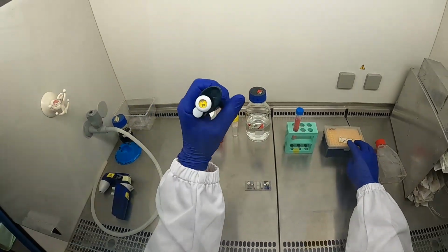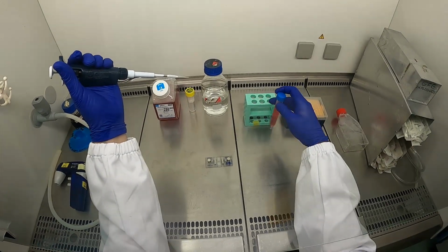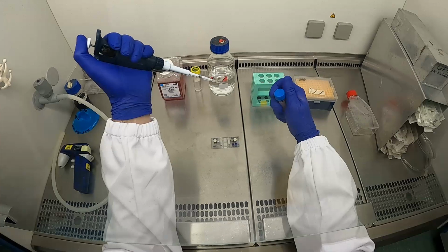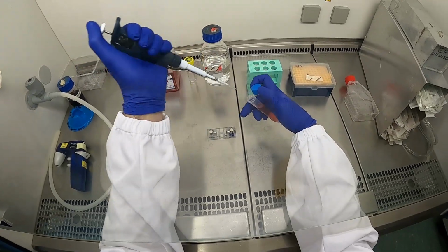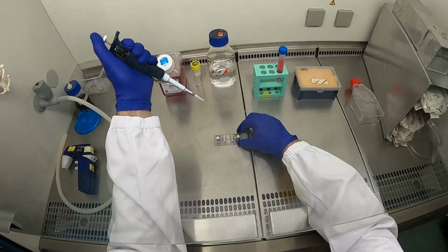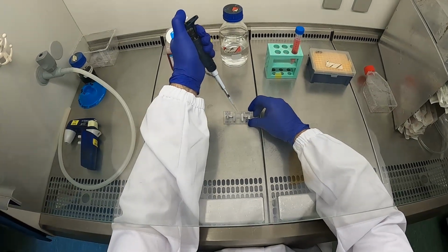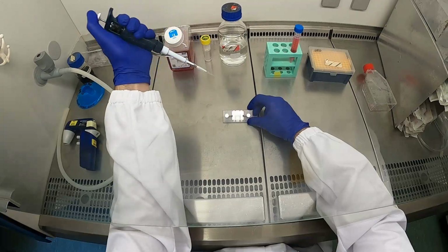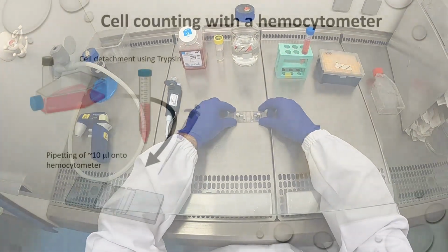Doesn't matter if it's a little bit more. So we take 10 microliters, make sure that you mix the cells, so the sample you're taking represents well the whole cell suspension. Introduce it in between the glass cover slip and the hemocytometer slide. Capillary force will nicely pull it in, and then you're ready to count.